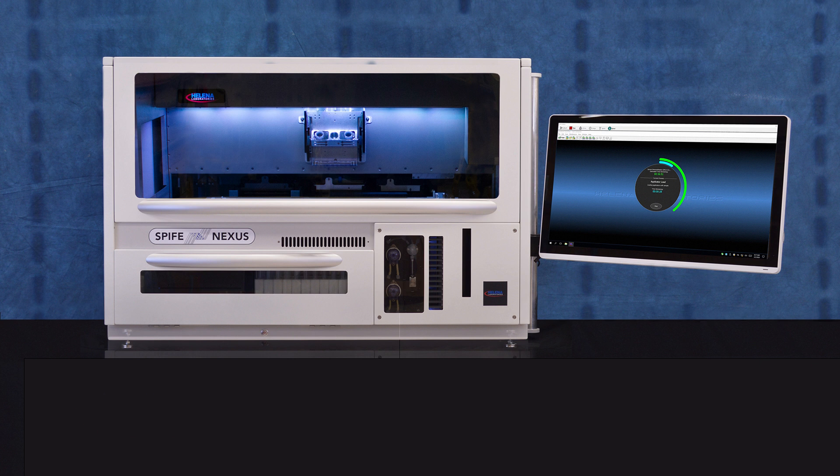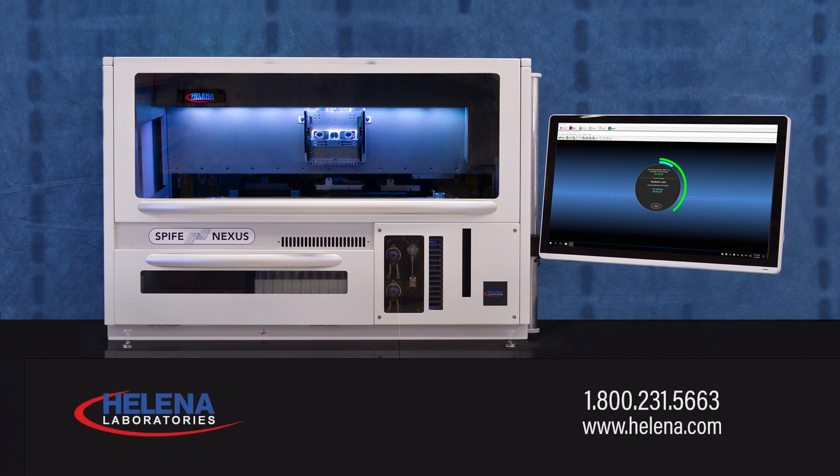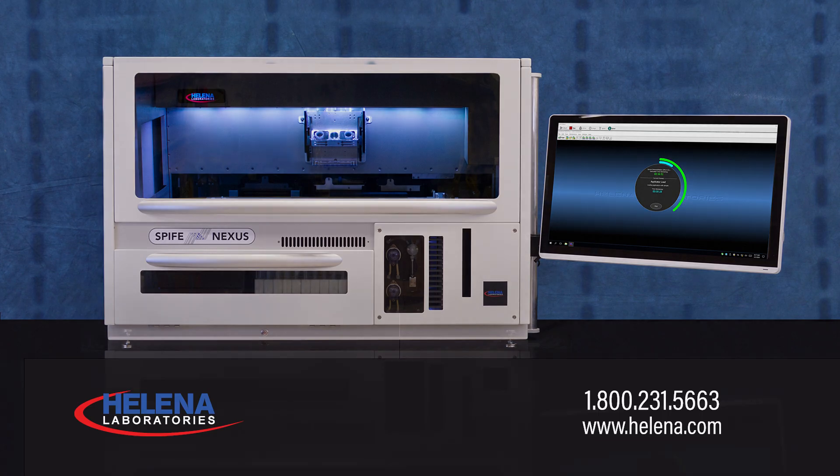SPIFE Nexus has proven to be a robust solution for many laboratories, providing a clear path approach to a totally automated, efficient gel electrophoresis.